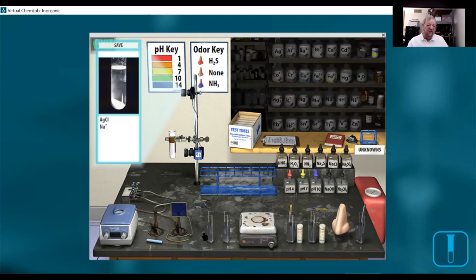In case you don't know, your washing machine is a centrifuge. When it goes to spin, it's really a centrifuge getting all the water out of your clothes, which is a good thing. And therefore, we're done with this experiment.